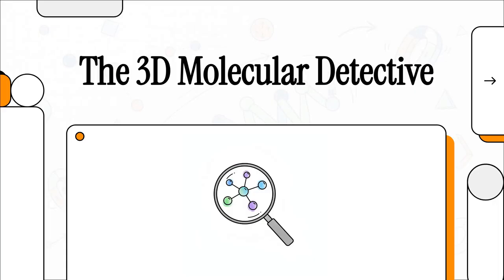Well, welcome to our exploration of NOE difference spectra. Today we're going to see how advanced spectroscopy basically acts like a molecular detective to unlock those hidden 3D shapes. We'll be using advanced enhancements, specifically the nuclear Overhauser effect difference spectra, to determine the exact 3D spatial location of protons. It is super cool.